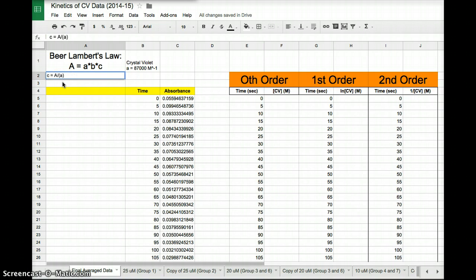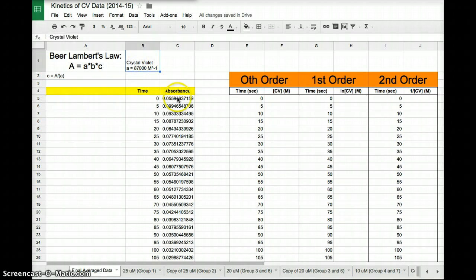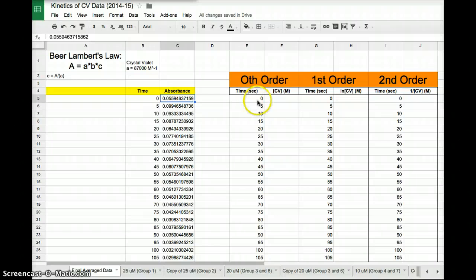So what I'm left with is C concentration is equal to the absorbance divided by the molar absorptivity constant. So what I need to do is I need to take this number and divide it by 87,000. Well, instead of doing that with a calculator or on paper, that's super boring and annoying, let's use the computer to help us out.